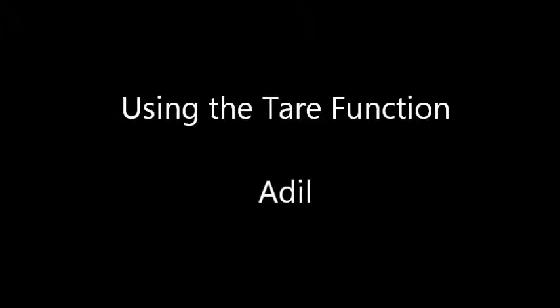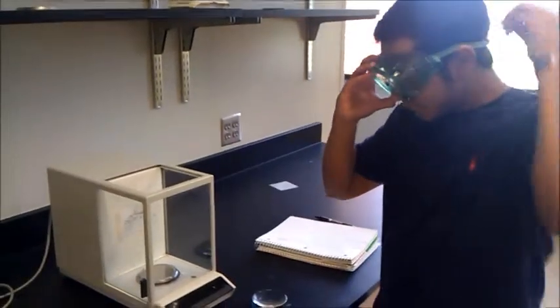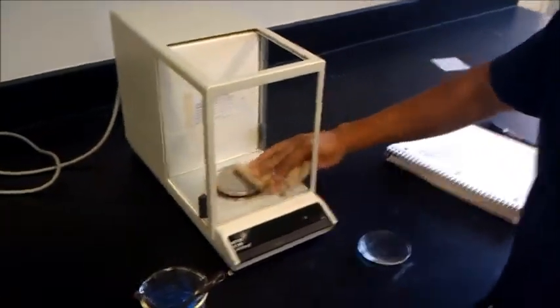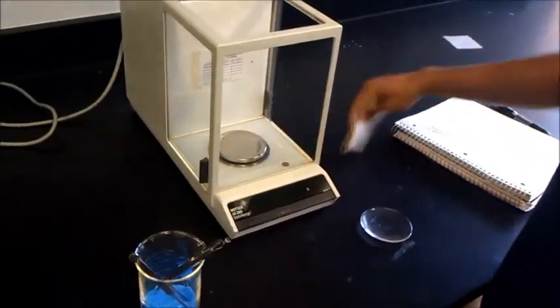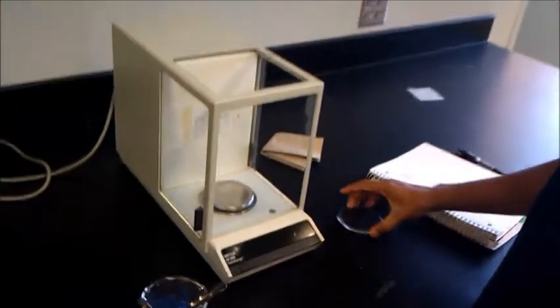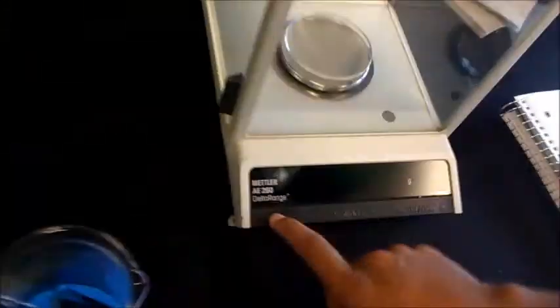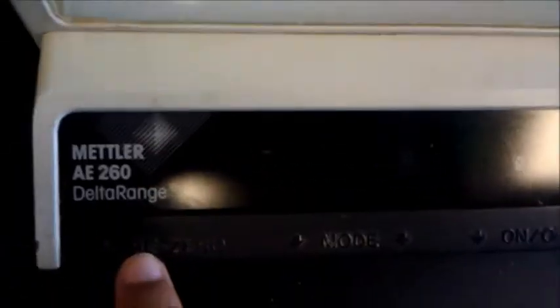And now, Adil will show us how to use the tare function on the analytical balance. Just as before, he starts off by cleaning the balance of any foreign debris. He then places the watch glass onto the balance and slides the door shut, and then he zeroes it to get as close to zero as he can, even with the fluctuations.